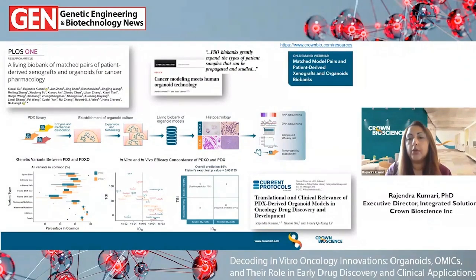You can also generate sufficient material in a dish. So again, you can do large scale screens. And then you can carry these studies on afterwards, because they can be replenished and revived from cryopreservation. So the paper also describes the application for drug screening, looking at the robustness and also how the matched models are able to predict the in vivo response. So there's very high correlation between the in vitro and the in vivo.